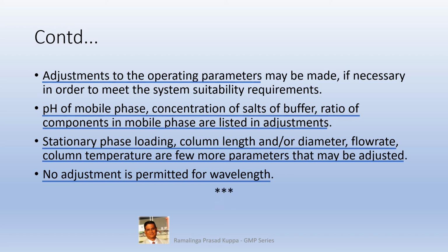I hope that the requirements of interpretation of chromatograms is understood well. Read and understand USP chapter 621 fully. Same information may be found in EP 2.2.46 also.